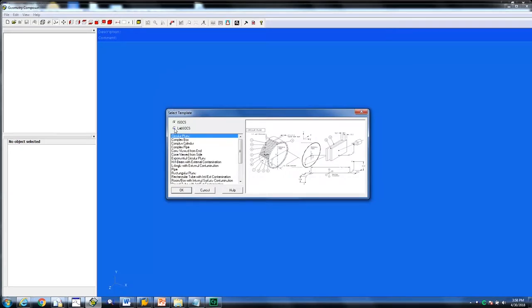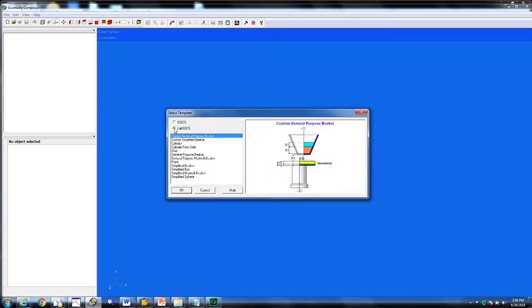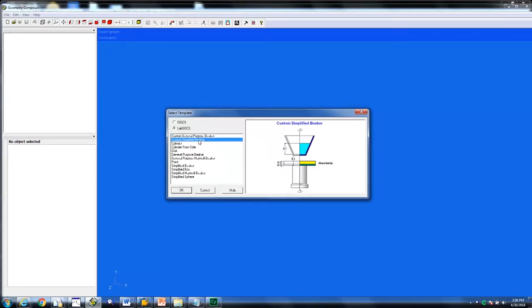For the Sage Well Detector, to create a geometry inside a well requires one of two custom templates listed, either a custom general purpose beaker or the custom simplified beaker. The custom simplified beaker is the one we are going to use.